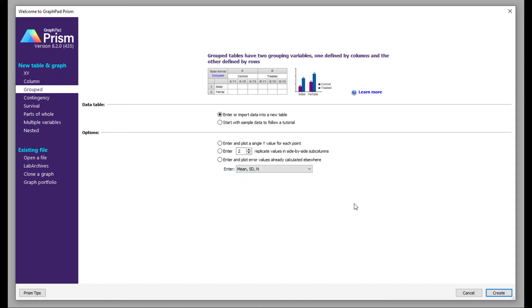Then you have grouped, where you have multiple columns for a particular group. Grouped tables have two grouping variables — one defined by columns and the other defined by rows. So if you have different groups at a particular treatment, you can use this setting.